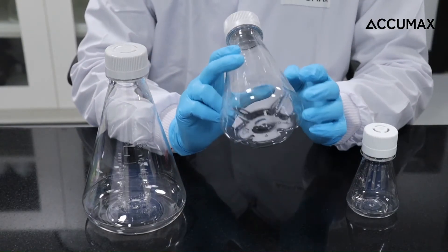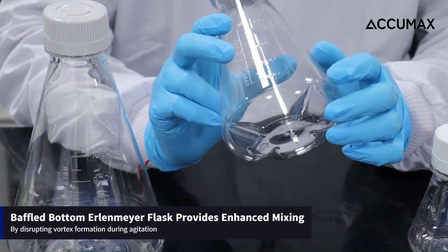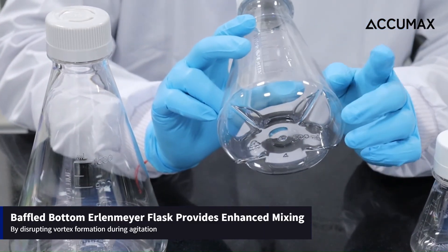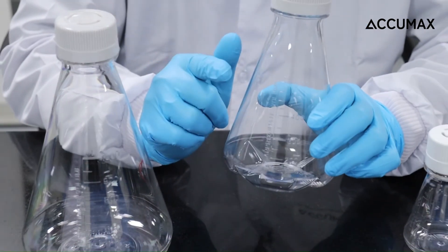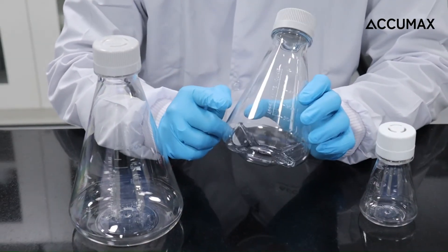The baffled bottom option of Aerolimere flask — as you can see, this is a baffled bottom Aerolimere flask — provides enhanced mixing by disrupting vortex formation during agitation. This bottom design improves the efficiency of mixing solution, cultures or media, ensuring uniform distribution of components.